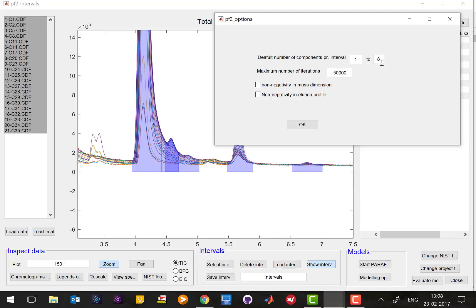It makes perfect sense to do one to eight. Basically you would want to do one to twenty but it's going to take a long time, so what you want to do is to save a little time you keep the maximum number a little bit low and eight is a nice compromise.